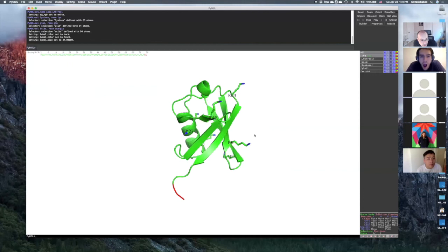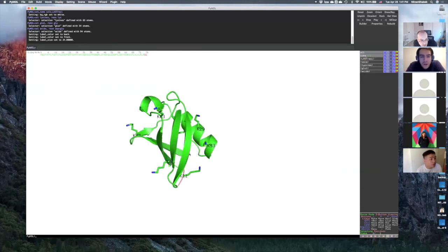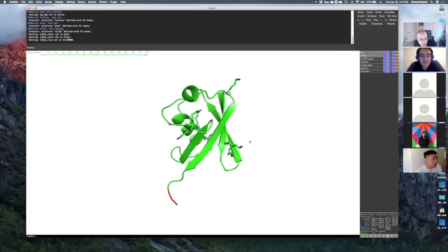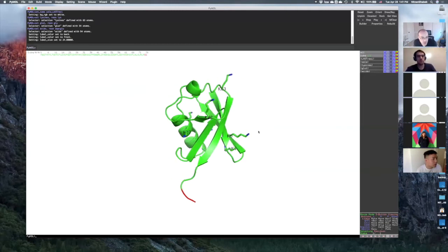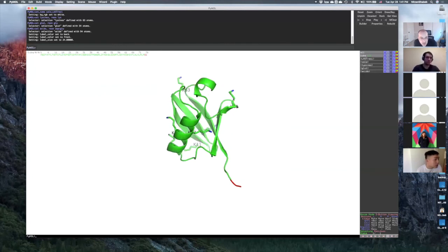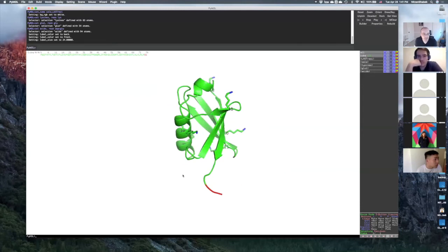So we can now see the amino acids, and we can see exactly each of these residues that can be attacked by another ubiquitin. So essentially, at K48, another ubiquitin will come with its C-terminal here, and will make a polyubiquitin chain right here, okay?